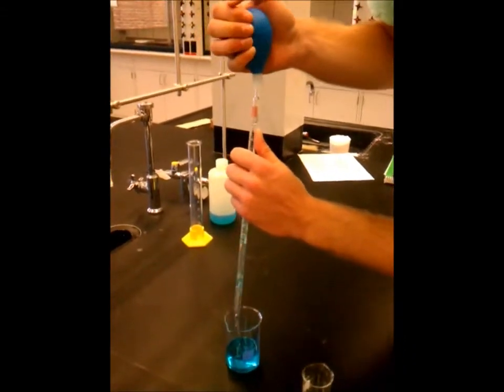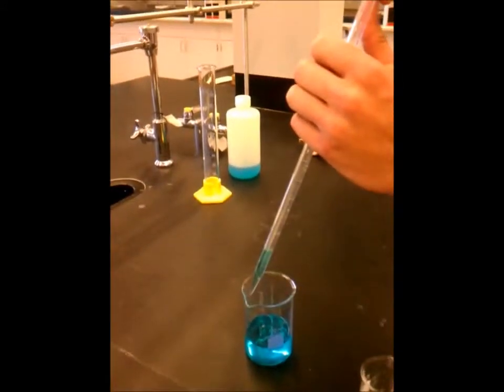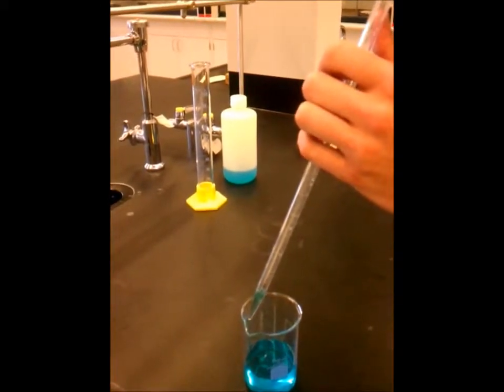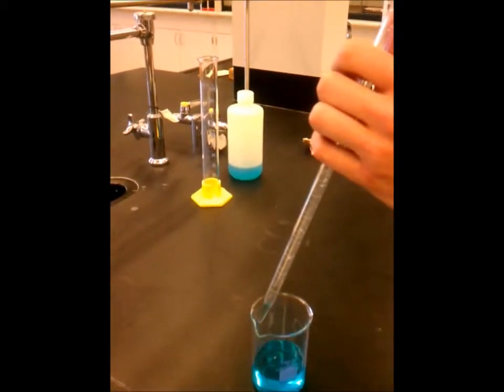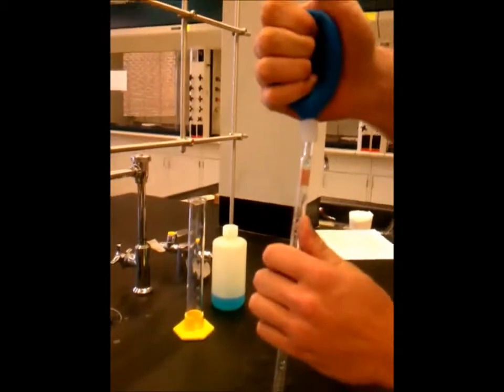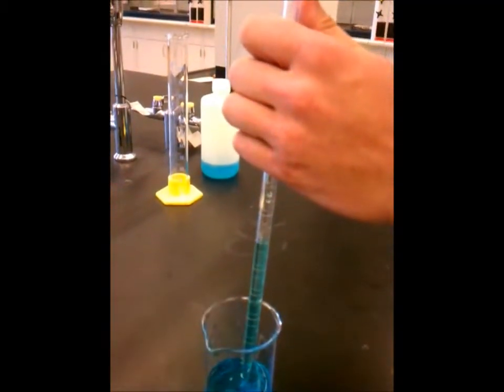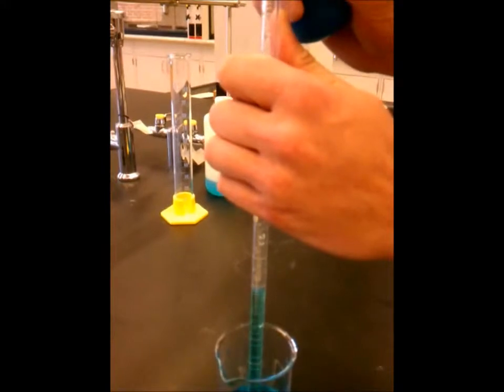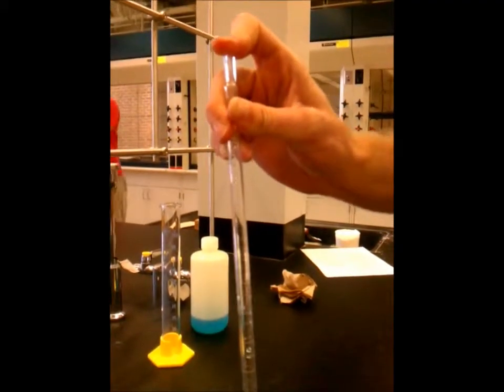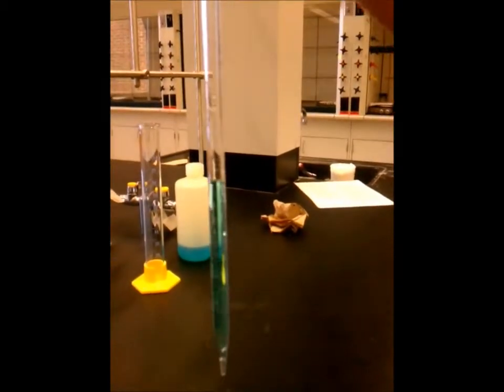Right in there, so I'm just going to let that out. When you let it out, you need to put it on the side so it doesn't get splashy. Okay, ready to try again? And when you're ready to measure, put your index finger on the top. That'll be more stable with the liquid.